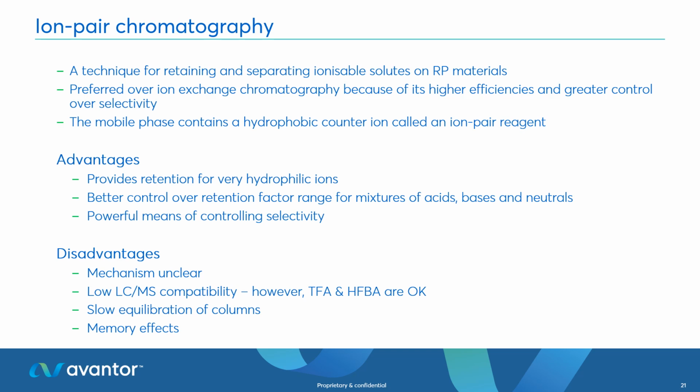Typically, it's preferred over ion exchange chromatography, which uses the principles of interactions between oppositely charged electronic states, because we get higher efficiency and we can also hopefully get greater control over the selectivity. In order to work, the mobile phase will contain a hydrophobic counterion, often referred to as an ion pairing reagent. So it provides retention for very hydrophilic ions, gives better control over retention factor for mixtures of acids, bases, and neutrals, and is a powerful means of controlling selectivity.